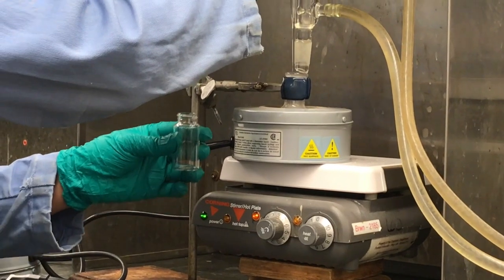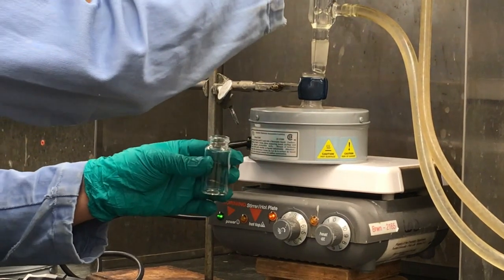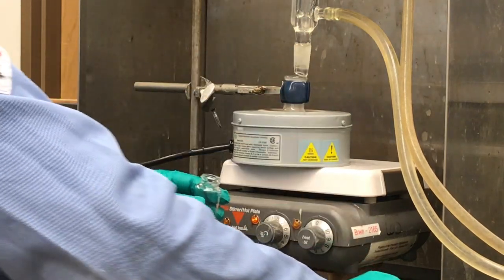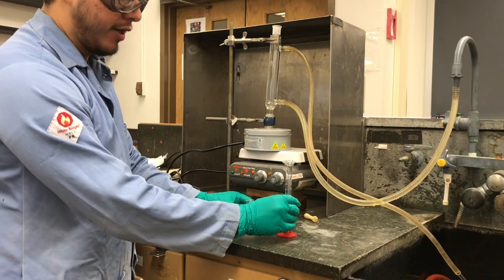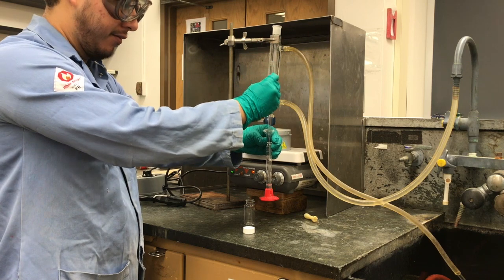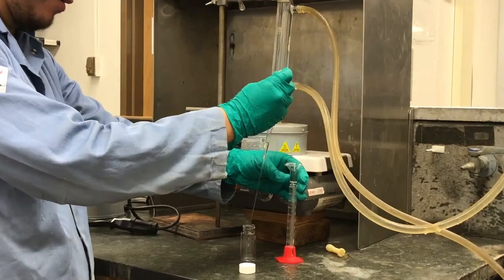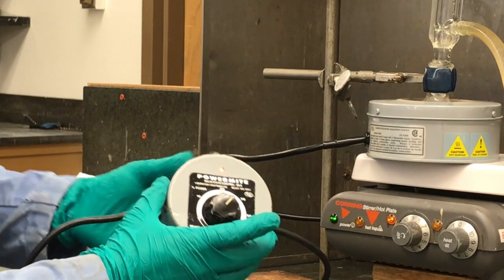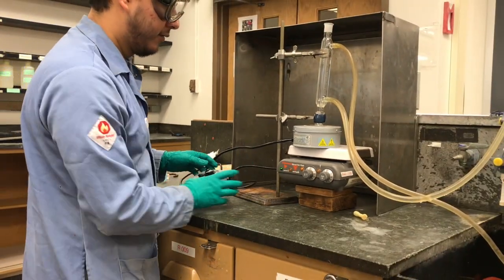So before we start heating the reaction, we're going to take a couple drops so that we can analyze it by thin layer chromatography and compare it to the starting materials, benzaldehyde and ethyl acetoacetate. So I just took out a couple drops and I'm going to dilute it with 10 drops of ethyl acetate. So now we start to heat the reaction. We're going to turn it about 2/3 of the way, and hopefully in a few minutes the reaction will start to reflux.